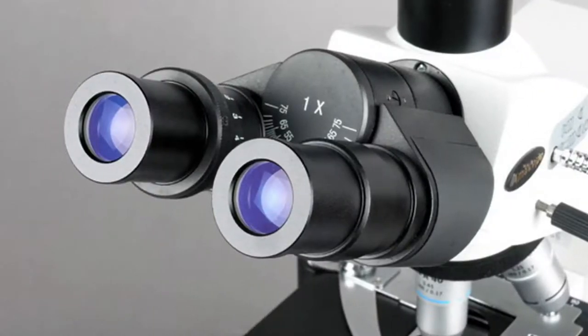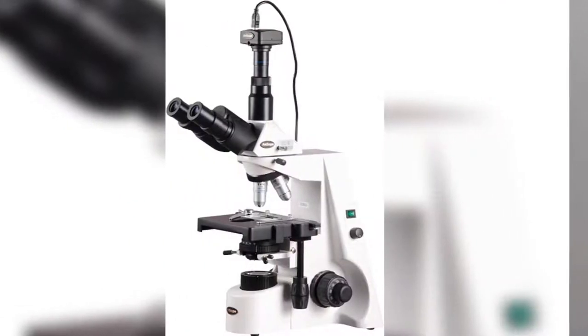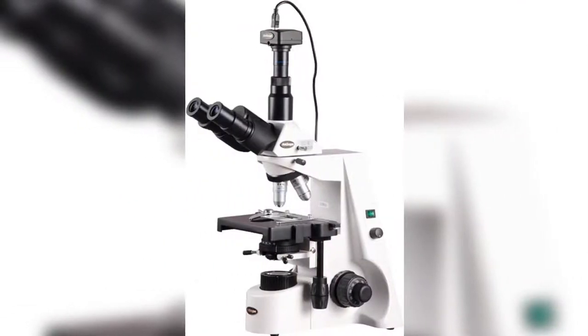The 5MP camera has a CMOS color sensor, a reduction lens, image capture and editing software, and USB 2.0 output to capture or display still or video images on a computer or projector.